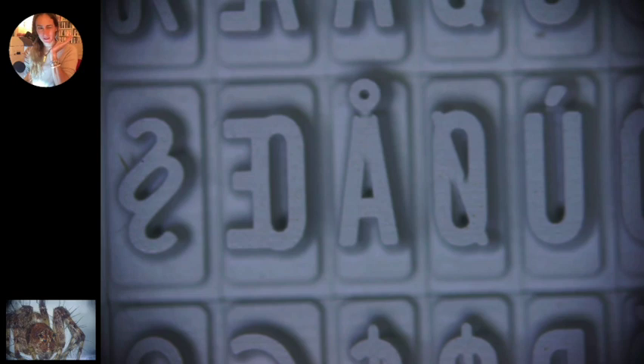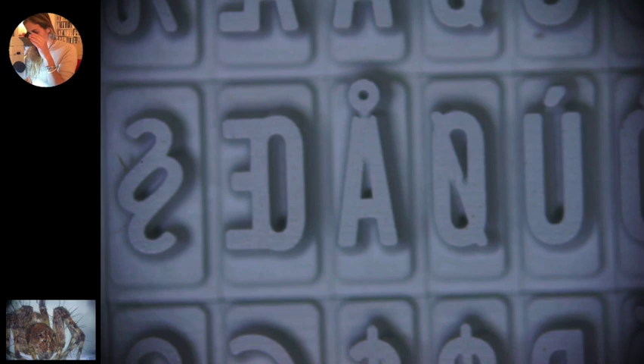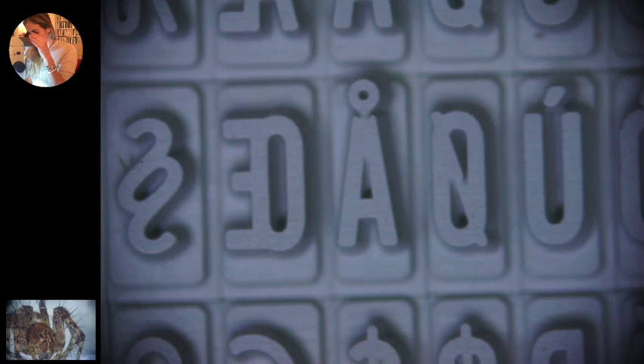Once I've done that, I make sure both eyepieces are set at the zero line on top. Then I start with my right eye, closing my left, and turn it until it is as clear as I saw it on the computer screen. Remember, what you see through the binoculars will be slightly different — it will look three-dimensional, like you can fly right through it — whereas the screen in front of you will be a two-dimensional image.